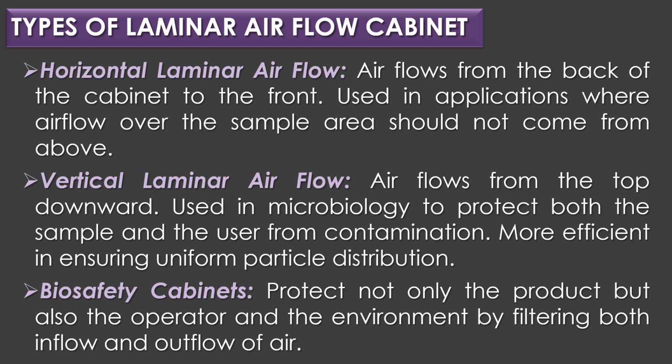The second type is vertical laminar airflow. In vertical laminar airflow, air flows from the top vertically downward, and it is commonly used in microbiology to protect both the sample and the user from contamination. This type of cabinet is more efficient in ensuring uniform particle distribution. Biosafety cabinets. The biosafety cabinets, sometimes grouped with laminar airflow hoods, protect not only the product but also the operator and the environment by filtering both inflow and outflow of air.